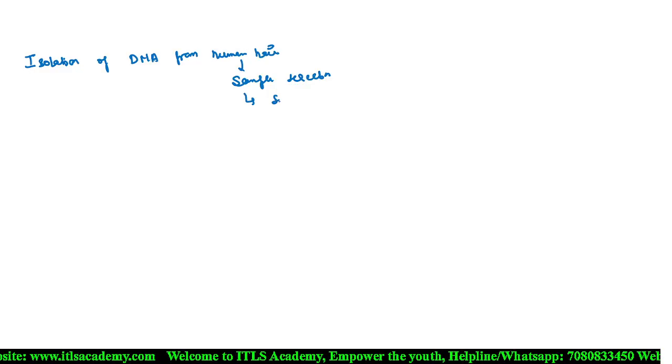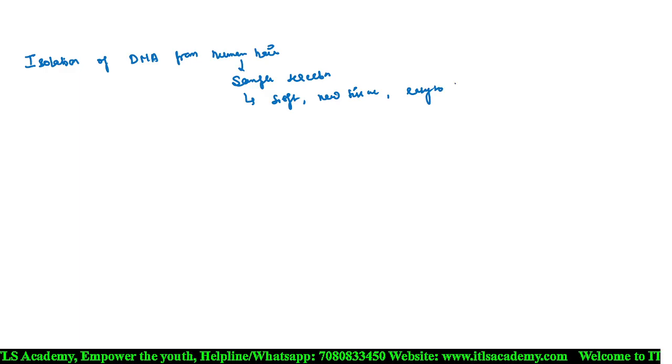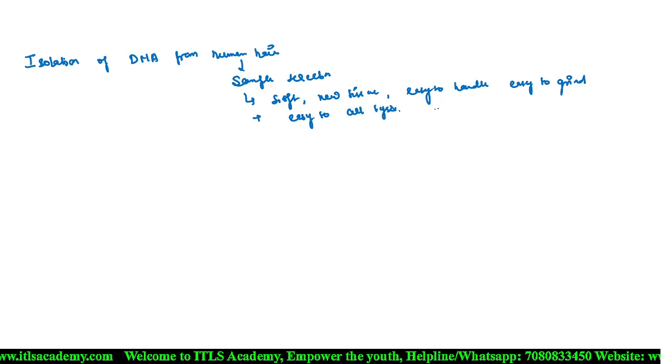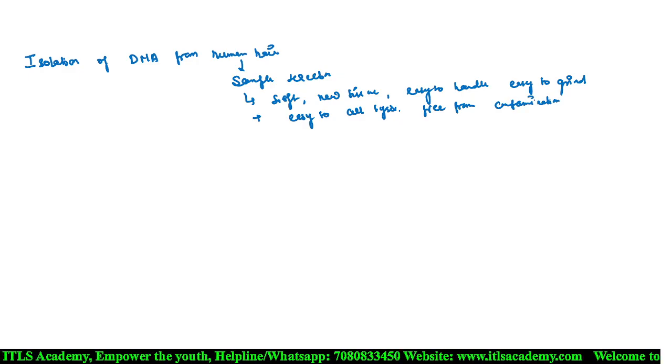The sample should be soft, new tissue, easy to handle, easy to grind, easy for cell lysis, and free from contamination.